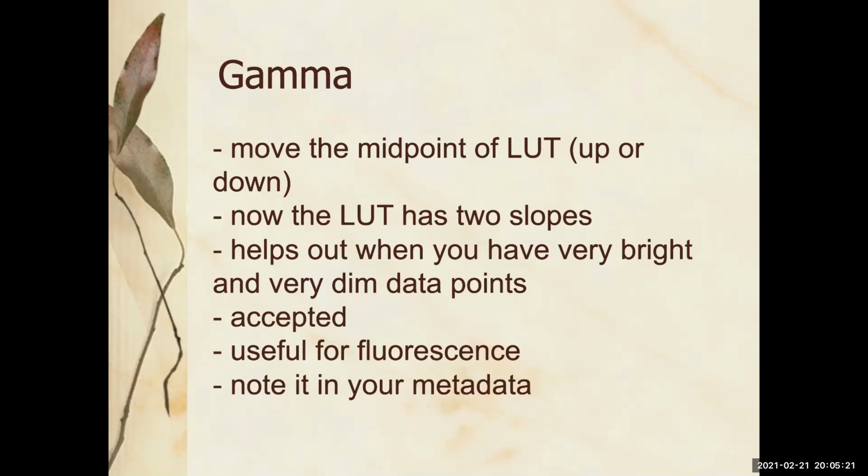And that's when you earn the big bucks, so to speak. You become the magician in the lab that people come to: tell me how to use a microscope, first of all, how to prepare the specimens. I got this precious, precious image, but I can barely see anything. How can I see it and still be legitimate in the manipulation? I don't want to invent data. And you're like, let me show you how to gamma. And then you help the world. You help discovery, you help cure cancer.